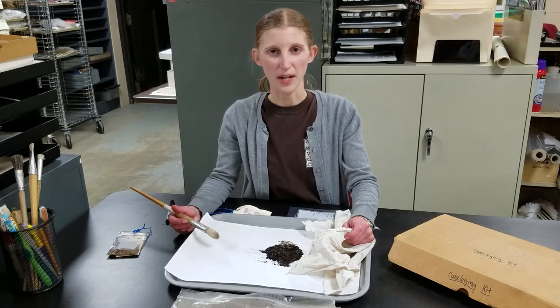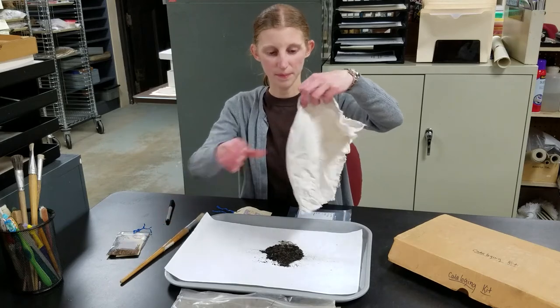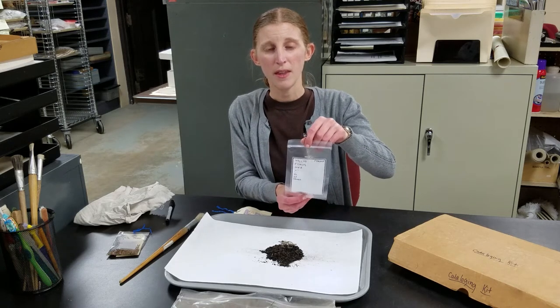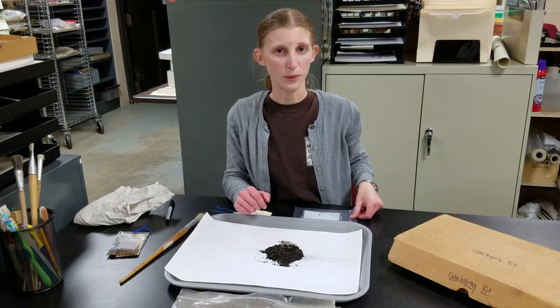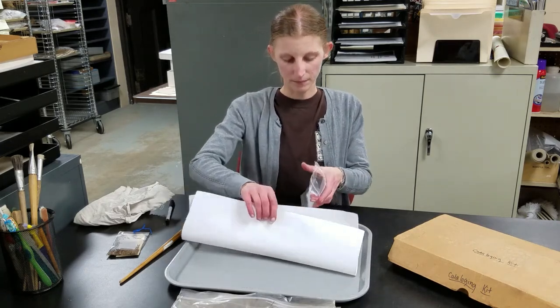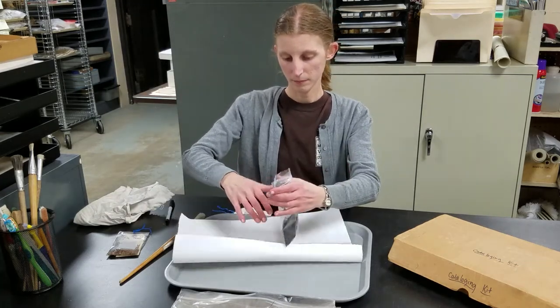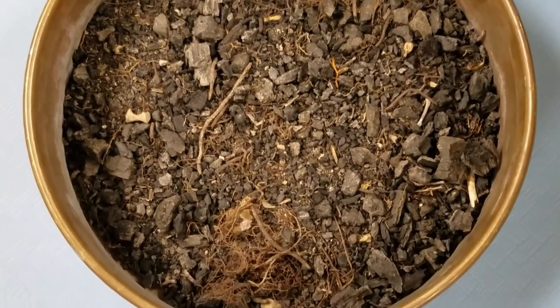After the light and heavy fractions are completely dry, they can be sorted and examined. First, we open the muslin and carefully pour it onto a paper-lined tray, then funnel it into a bag labeled with the provenience and cataloging information. Then comes the actual sorting process. In the light fraction, charred plant remains such as seeds are separated from wood and rootlets. In the heavy fraction, artifacts, bone, and shell are separated from sand and rock. Light fractions are sorted and examined under a microscope, since plant remains can be incredibly small or fragmentary, so a keen eye is important.